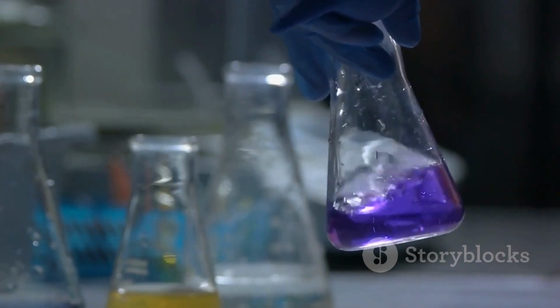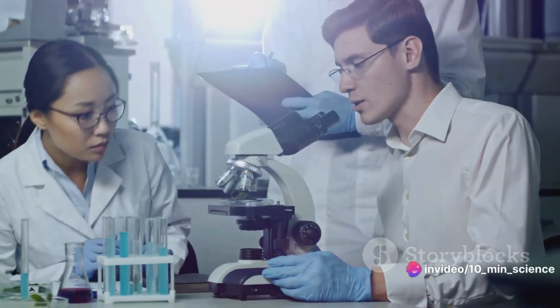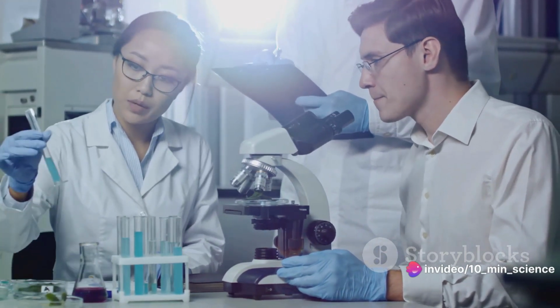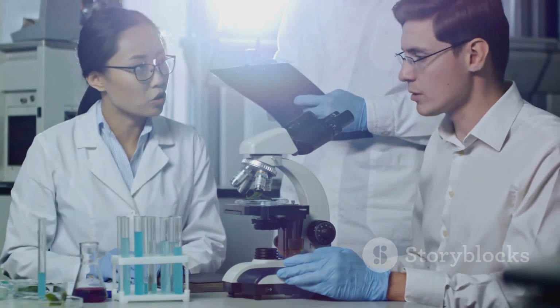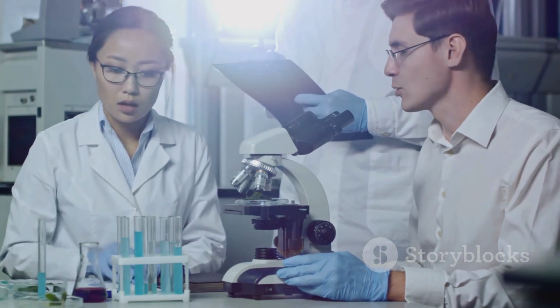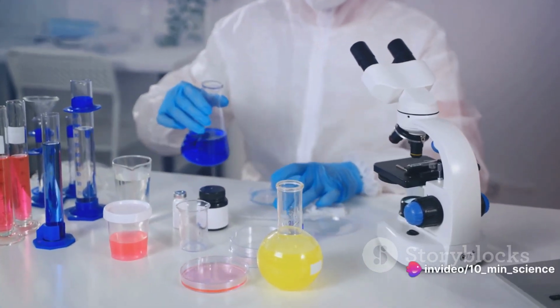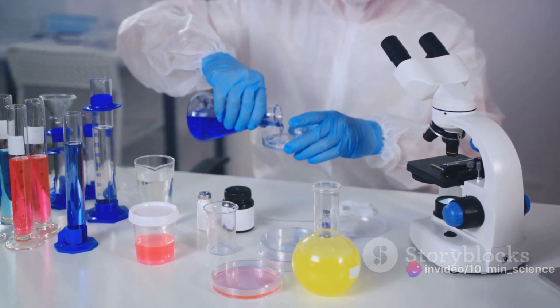After the preparation of your sample, the next step in the USP chapter <311> Alginates Assay is the actual testing. This is where the magic happens. It's important to remember that alginates are polysaccharides derived from brown seaweed. These substances have the ability to form gels, and this unique property is what we're testing for in this part of the procedure. So, how do we test the sample?